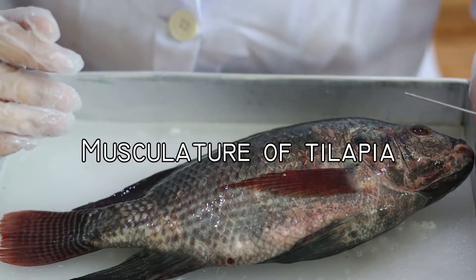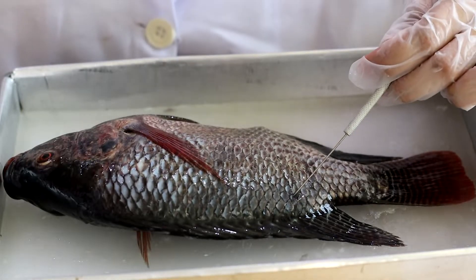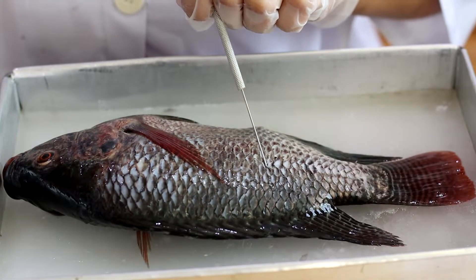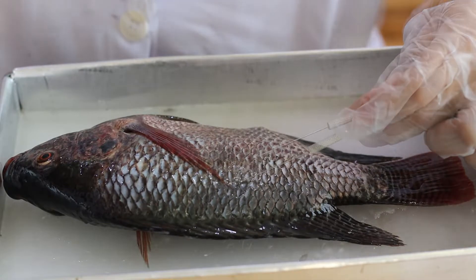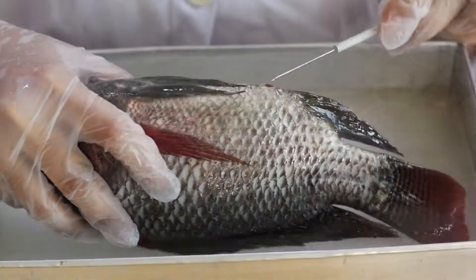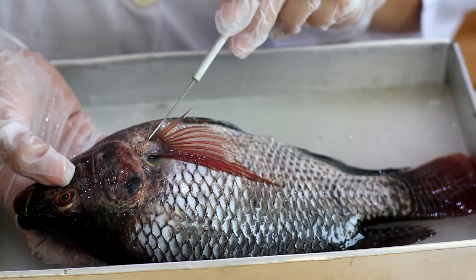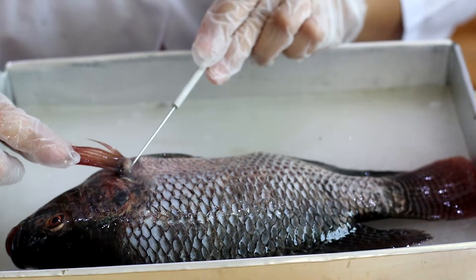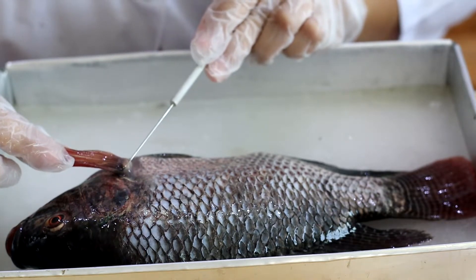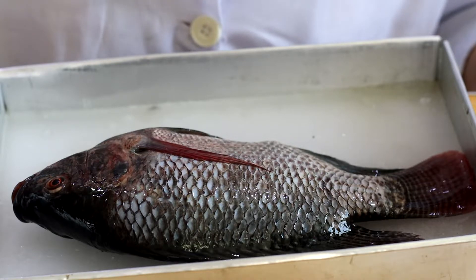Next, let's move on to the musculature of the tilapia. Here is the myomere, and here is located the epaxial. Here is the horizontal septum, the myoseptum, and here is the hypaxial. This one is the cloaca. Here is the abductor or extensor of the pectoral fin, and on the other side is the adductor or flexor of the pectoral fin.